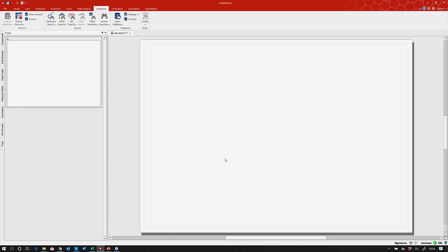It looks like nothing has happened, but basically now you have a connection to the database. And you can actually see that at the very bottom right here, where you can see that you have an active database connection. So the second thing that we have to do is create a database.